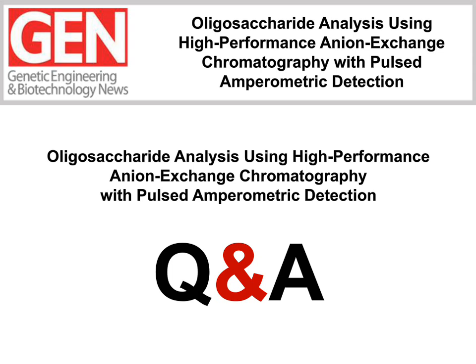Okay. Does Triton X100 need to be removed prior to injection using the CarboPac 200 columns, for instance? Yeah, I guess that's a yes and no question or answer. Generally, Triton is detected, so it's got hydroxyl groups. They are oxidized.